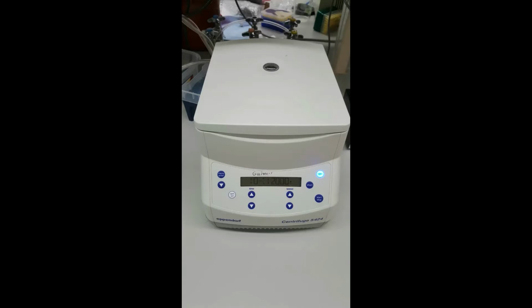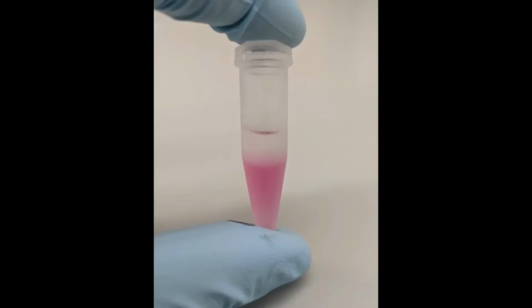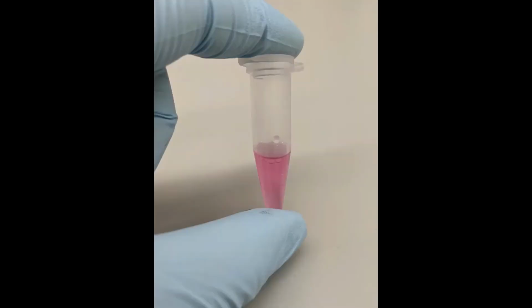While the samples are spinning, prepare another set of 1.5 ml tubes containing 65 microliters of 3 molar sodium acetate. If you had nice GlycoBlue pellets, you do not need to add any additional GlycoBlue here. However, if the pellets were a little weak, this is your chance to make them a little bit bolder. Following the spin, transfer the supernatant of the samples into the new tubes. Take as much as you can, but make sure it is clean supernatant.